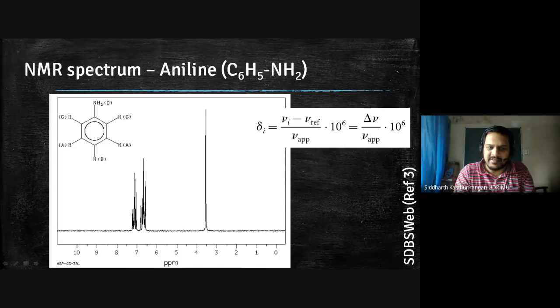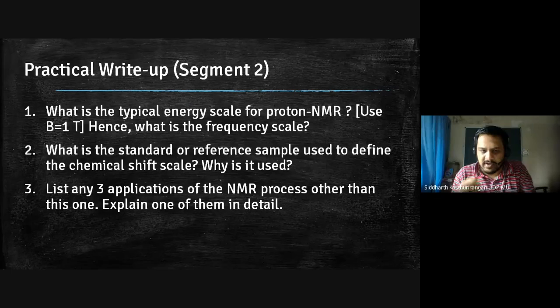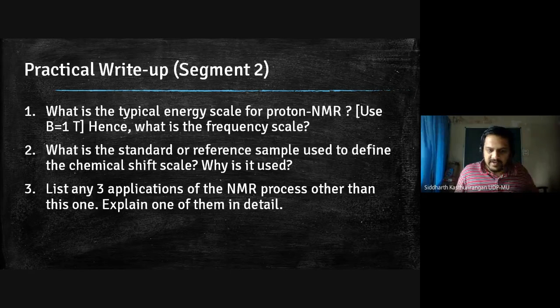It is just a terminology which is used, parts per million, but it is not talking about concentration. It is talking about the ratio of frequency difference divided by actual frequency. That is what it is talking about. It is not at all related to the concentration.